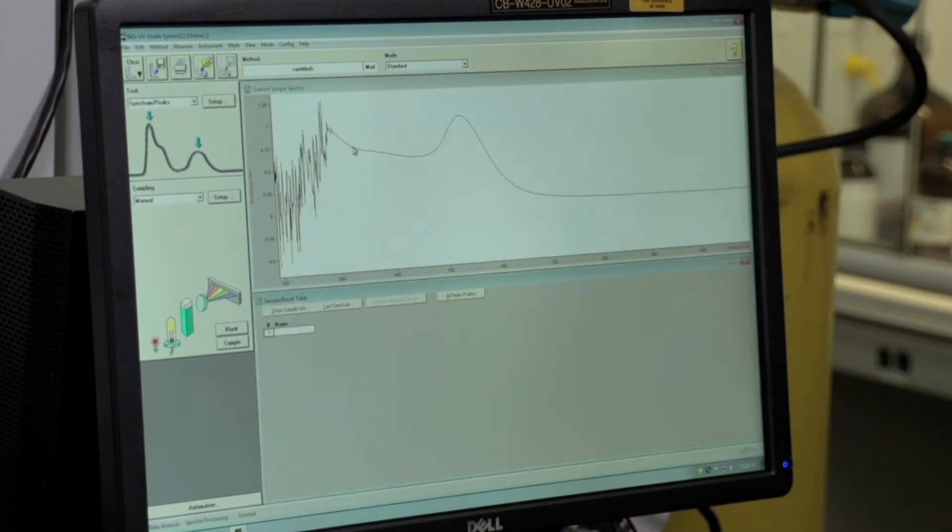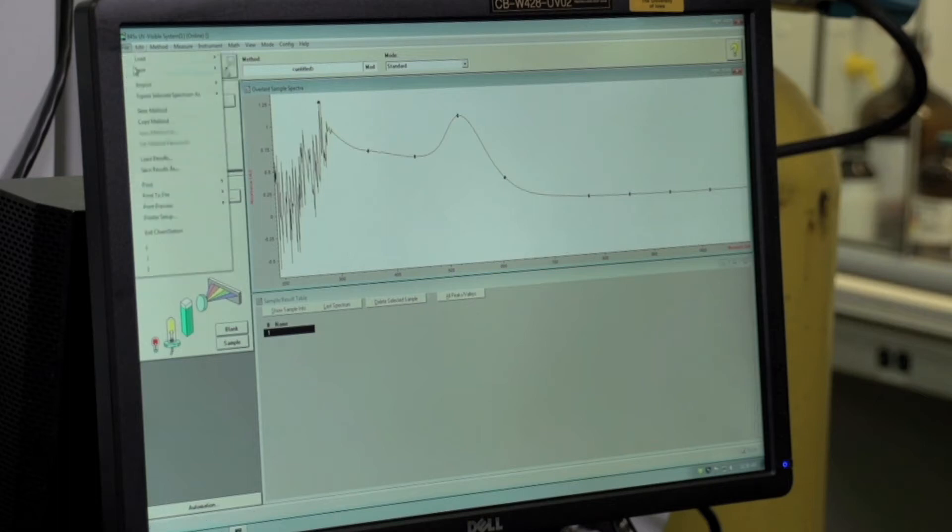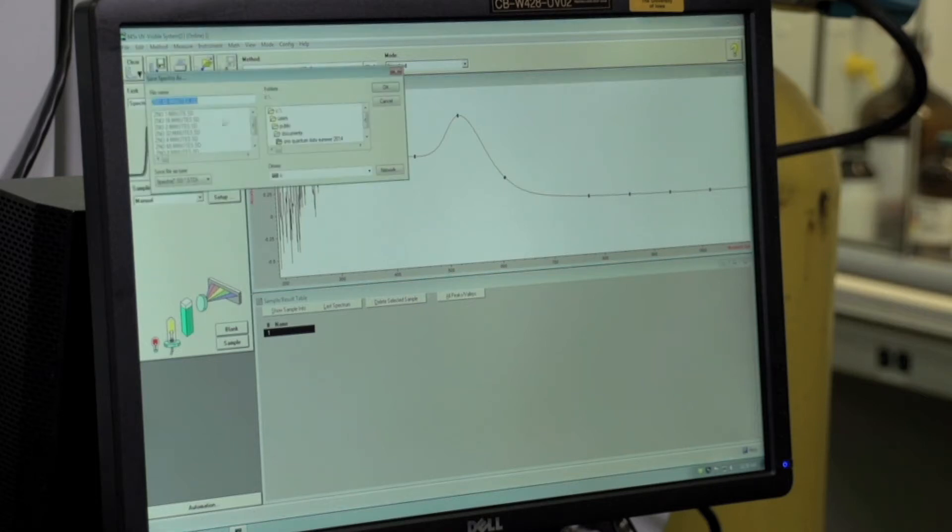This is the extinction of the nanoparticles. So we need to save the spectrum. So you will click it until it's highlighted and you can see that it's highlighted by these diamonds. And then go to file, save, save sample as, and save the spectrum file into a public file. So you'll want to go to the C drive and then users, public, public documents, and then save it in the class folder.